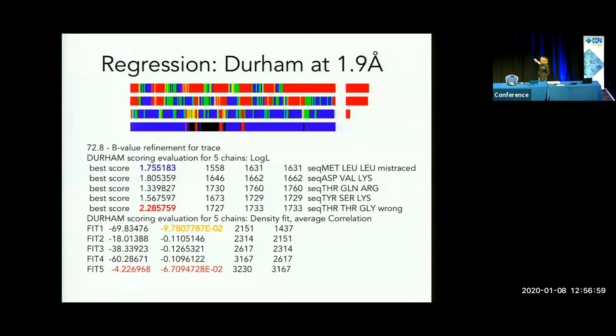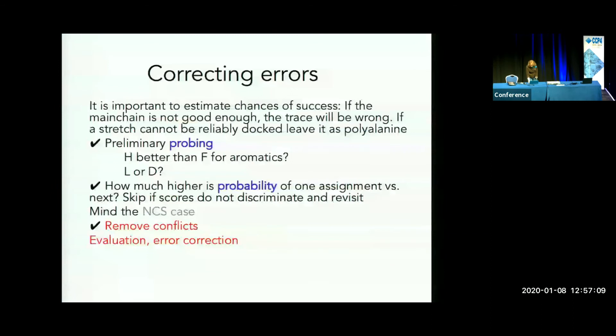One of the things that throws you off is if your main chain trace is wrong — that's what happens here. Black indicates a wrong assignment because there's a wrong connection, so there's no way those can be right, and as a consequence the trace has nowhere to go anymore. There's a lot to do about correcting errors, mainly on the main chain, which is an interesting challenge anyway — we need to change the algorithm to interpret cryo-EM maps, where the properties of those maps and their most prominent features differ.